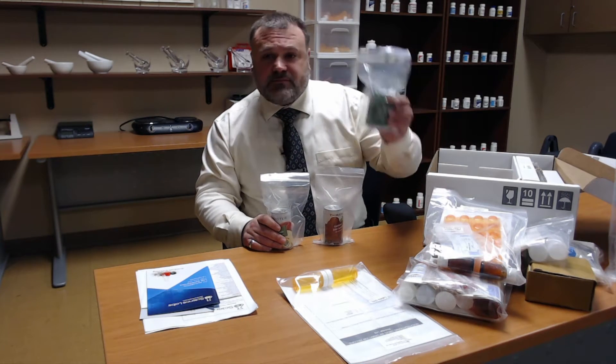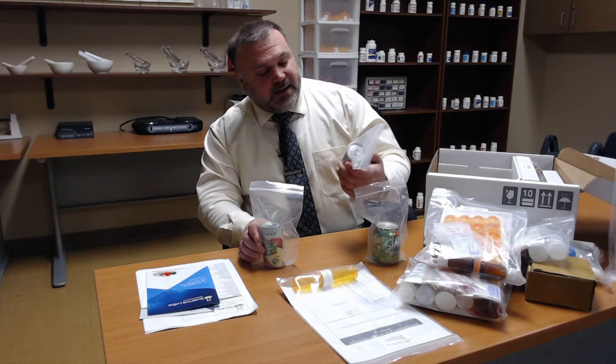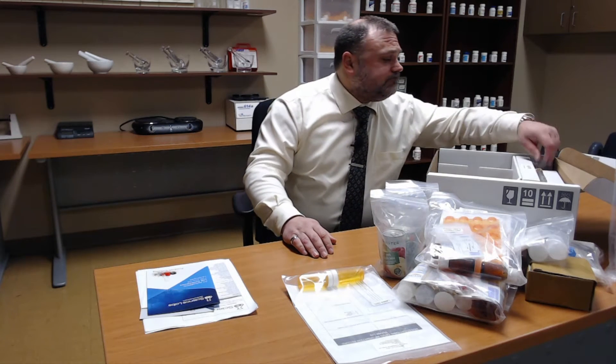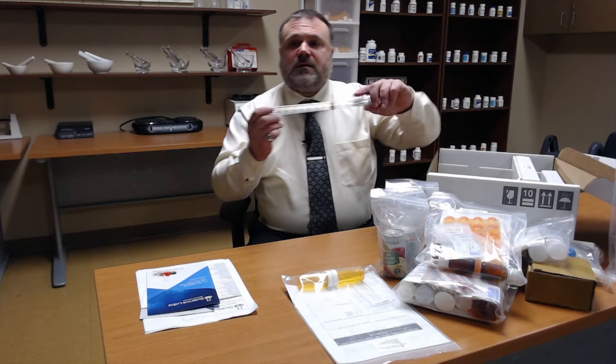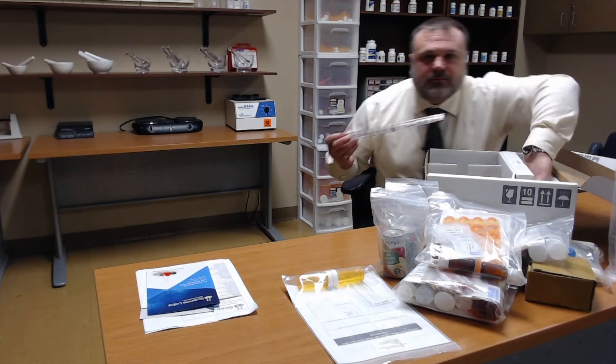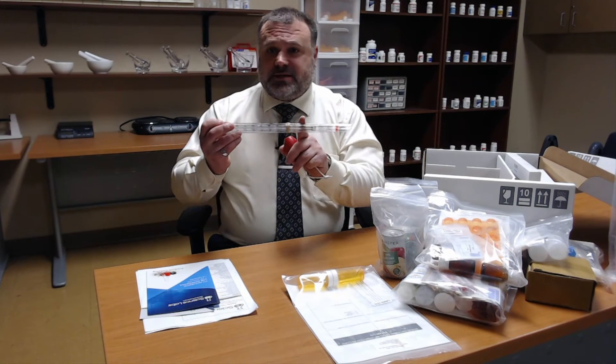We have some juices that we're going to utilize as liquids when we are doing our compounding: a small can of ginger ale, a can of apple juice, and a can of cranberry juice cocktail. Please do not drink these — you will be utilizing these in your labs, though you can always substitute different liquids you can find around your house. We have our pipettes, which are used for measuring. You will have a pipette bulb that attaches to the end of the pipette so you can measure liquids accurately.